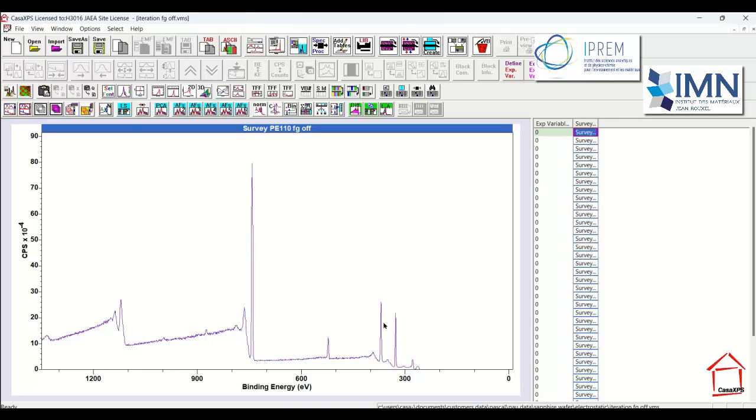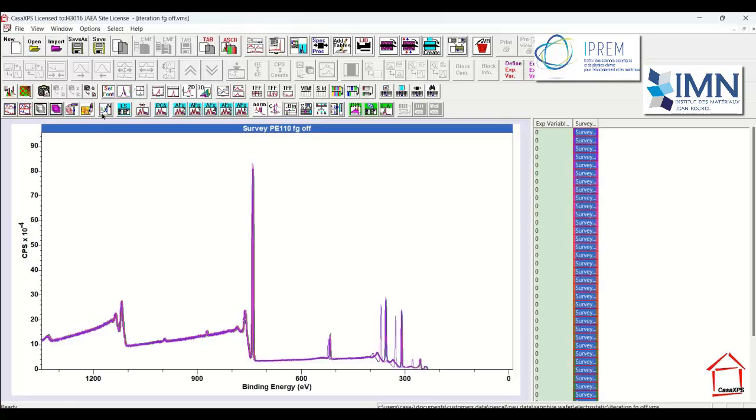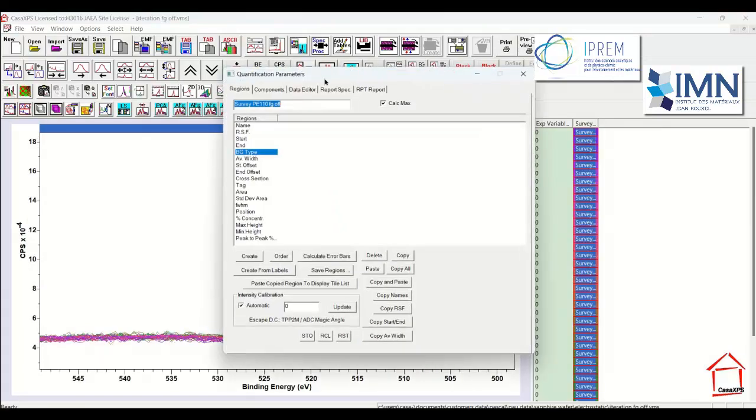is off. We see peaks that all look like the aluminium and the carbon and the oxygen, so we might think, oh, okay, we can just correct these data and that's good enough. So let's see what happens if we do the same operation yet again, but this time observing that the iterations do not produce identical peaks, so they are moving around. Still, we might be able to correct based on the carbon 1s and then achieve a decent calibration.